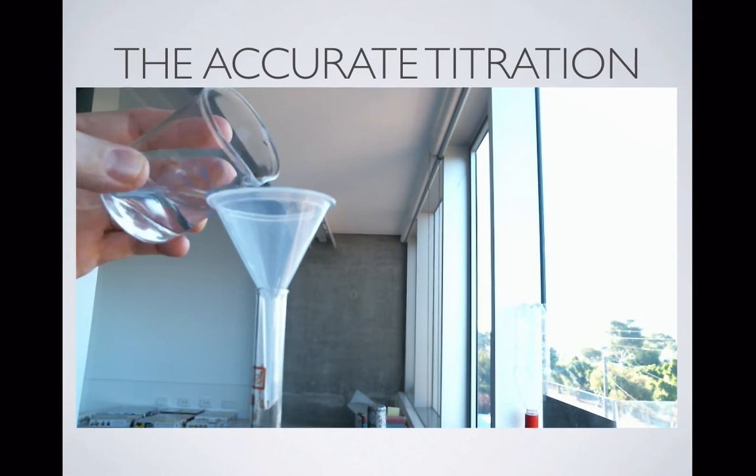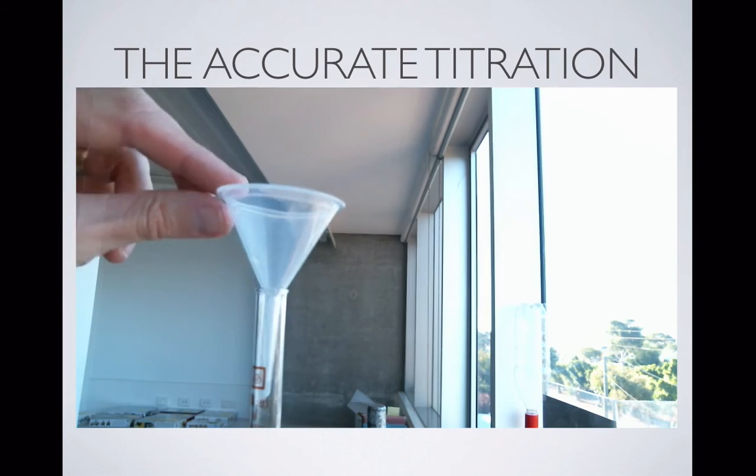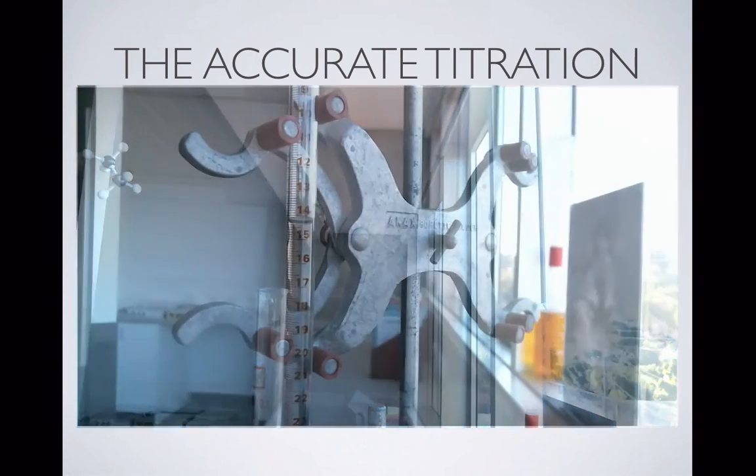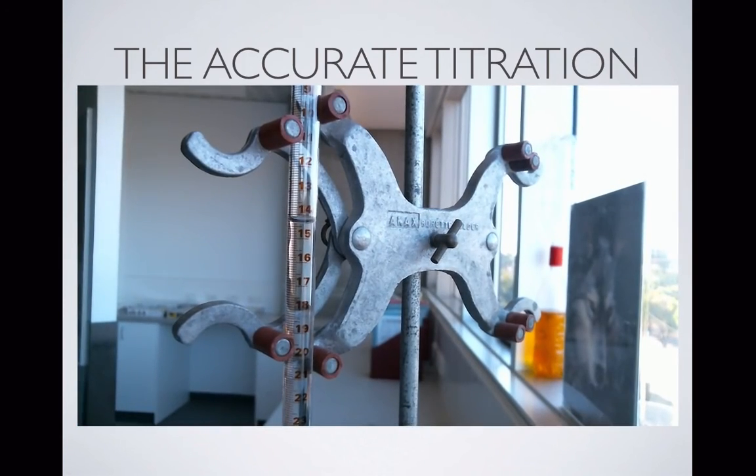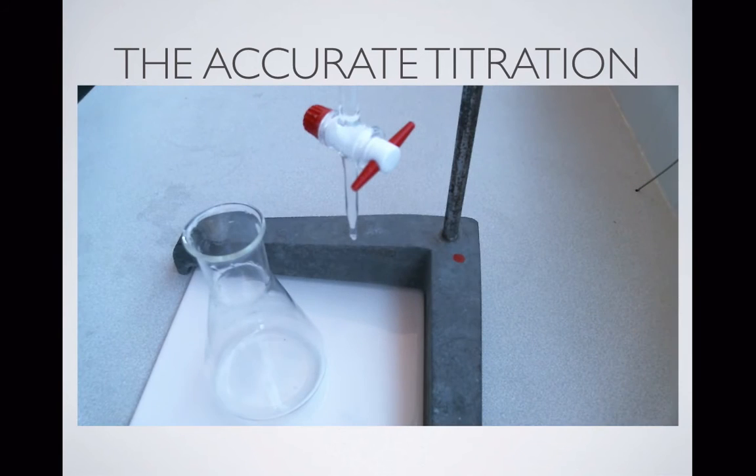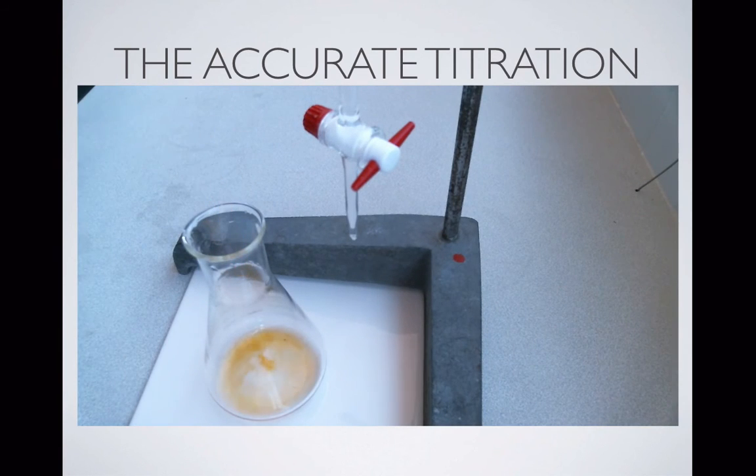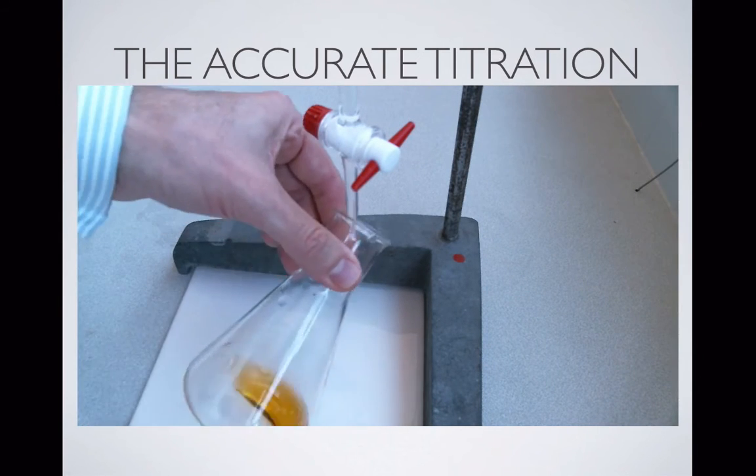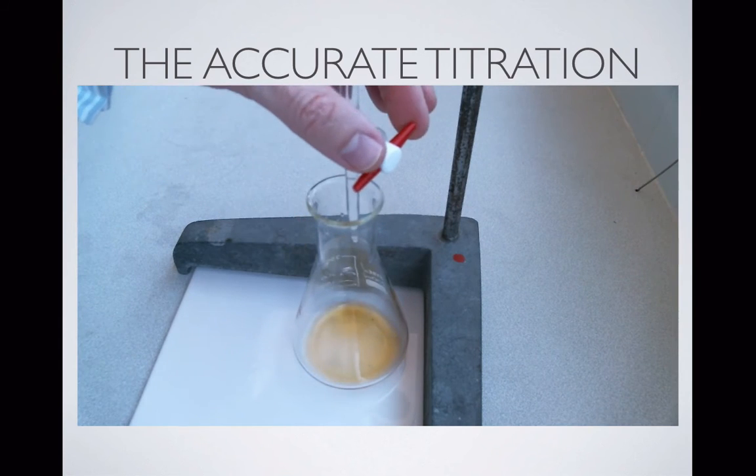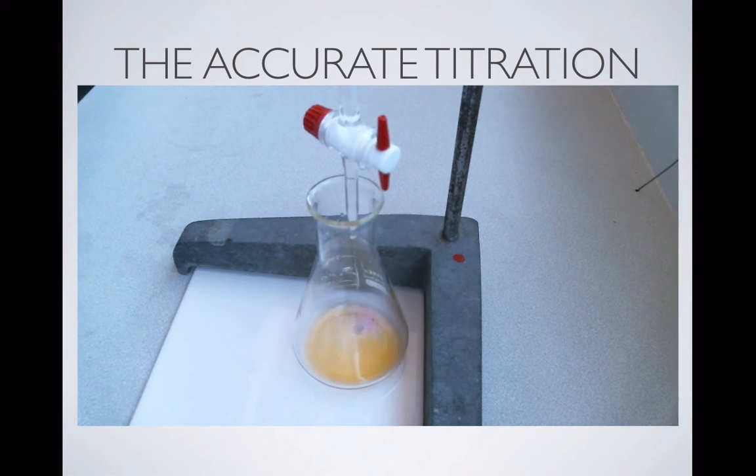But once we've finished doing that, of course we're going to remember to take our funnel out of the top because we don't want drops falling in. We're going to note our initial reading nice and accurately this time. Add a few drops of indicator and we can start titrating. Now the nice thing is, if we've done a rough titration, is that we know that we can add quite a lot of liquid straight away without worrying that we're going to overshoot the mark.